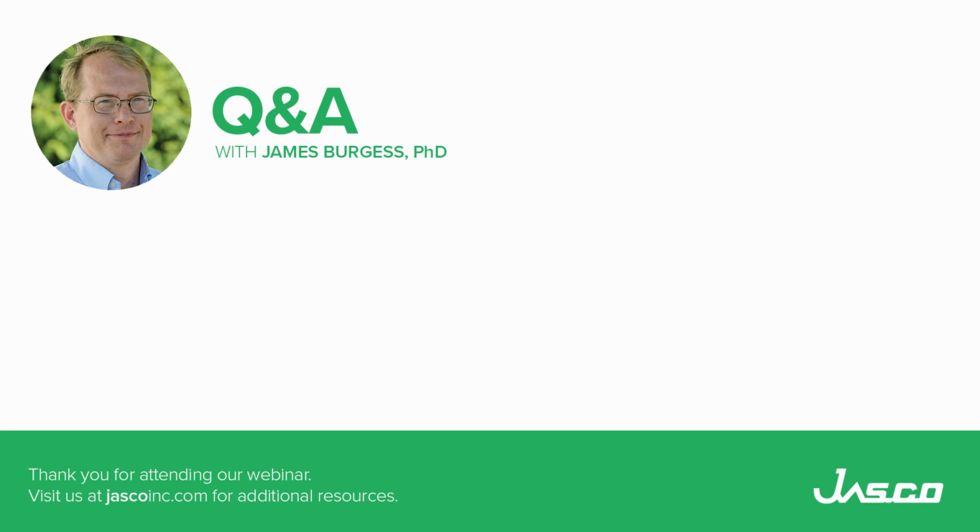So, could a transform other than the Fourier be used? I guess hypothetically, you can actually save the interferogram, and then in your own software, you might be able to use a different transform. I'm not sure why you'd want to, but that would be the solution. You can save the interferogram and use it to do your own method.